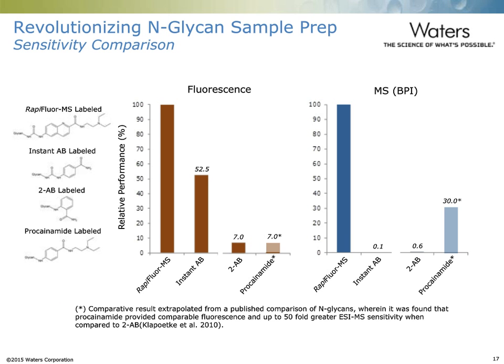that the heightened ionization with RapiFluor-MS results from its additional hydrophobicity. Indeed, previous studies have shown that the addition of hydrophobic surface area to a glycan label leads to an increased electrospray ionization. That the RapiFluor-MS label has a strongly basic side chain in addition to a relatively hydrophobic core structure is therefore noteworthy. More notably, the collected response factor data suggests that RapiFluor-MS labeling provides unprecedented fluorescence and MS sensitivity for profiling of N-glycans.